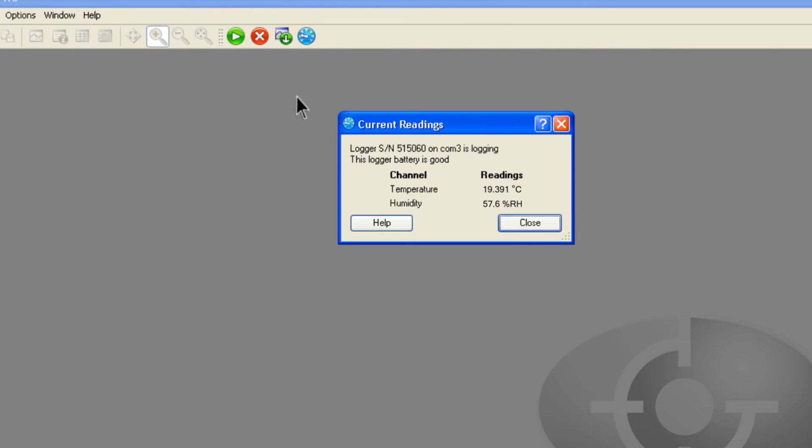If you just want to spot check the logger's current readings, there is an option to do this. A pop-up window will open showing the logger's current readings and battery status, which will be regularly refreshed.